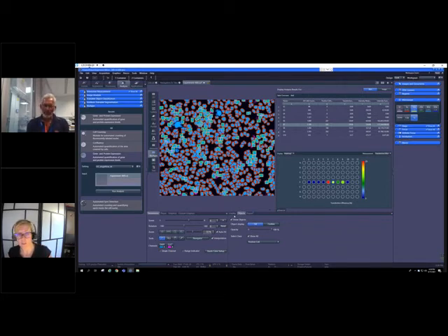Good point. The answer is yes. If your confocal comes with an Axio Observer 7, as you already stressed, if it is an LSM 900 or the latest 980, your confocal can benefit from AI Sample Finder as well as from Zen Connect and the bio apps we quickly had on display. And you can retrofit existing confocals as well. So if it's a 900, if it's a 980 on an inverted stand, why not?